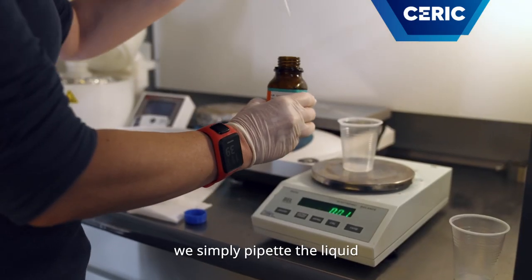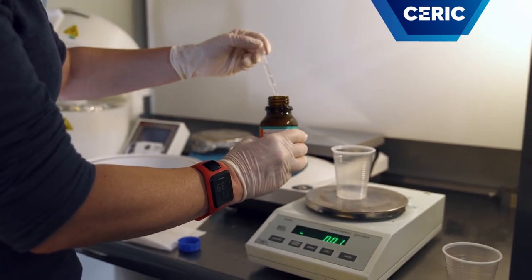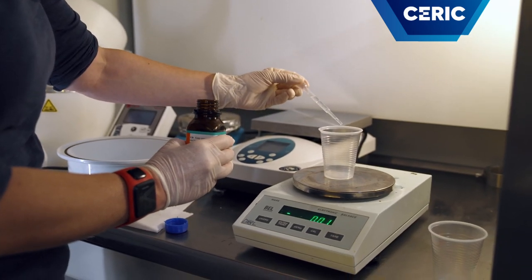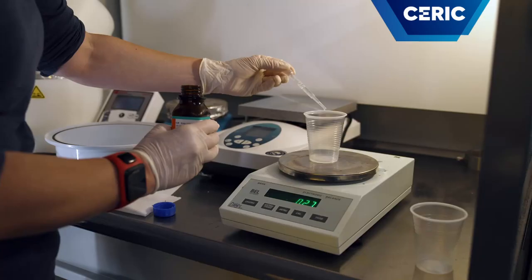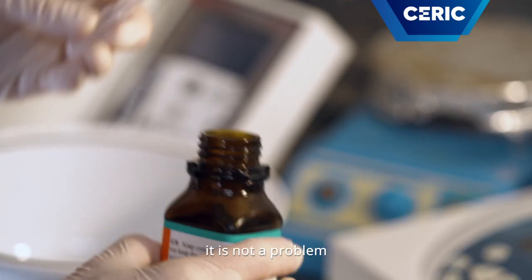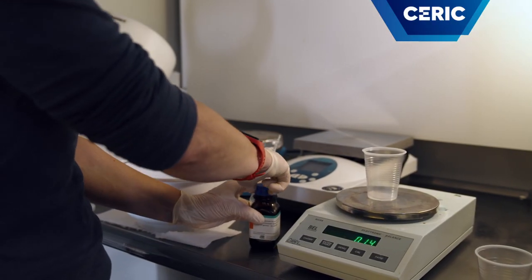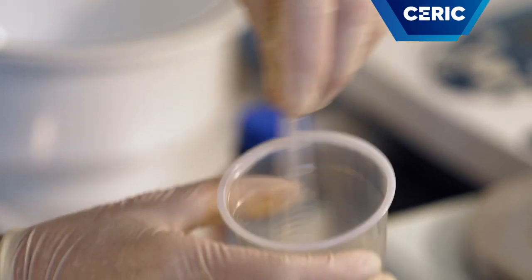To do this, we simply pipette the liquid. If there is a little more, it is not a problem, because the PDMS will just be more rigid. Now we can mix them together for 5 minutes.